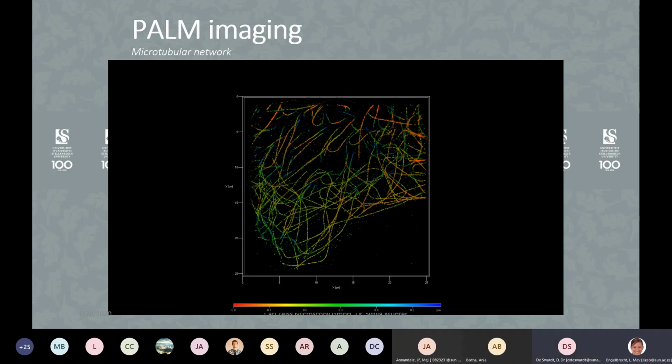I'm not sure if Ms. Raz meant the Z point in the Palm storm, but that was Z position in the point spread function, which means the elongated part instead of the nice smallest diameters. Z plane in Palm storm again means depth, how deep you are into the sample. No matter how thin you section it or how thin your cell, if you have a monolayer of cells, you would always have some sort of depth, and that depth we talk about is the Z dimension of the sample. Okay, anyone else with a question?